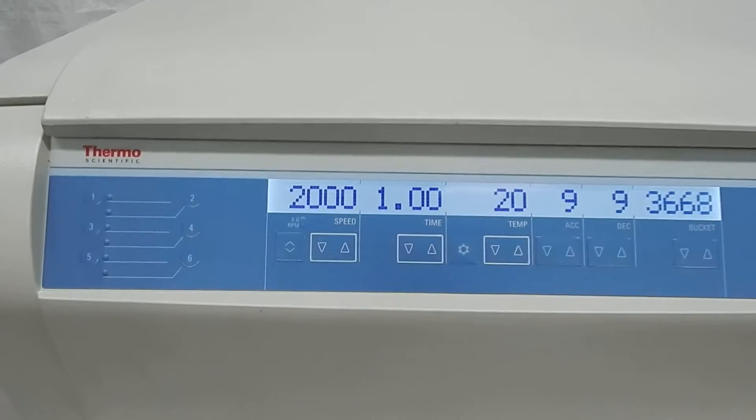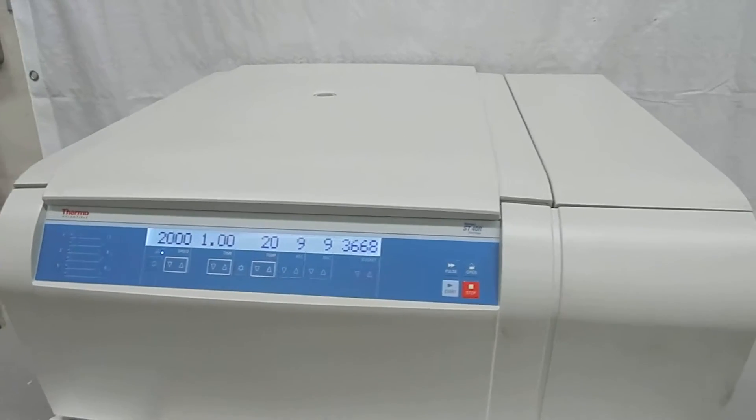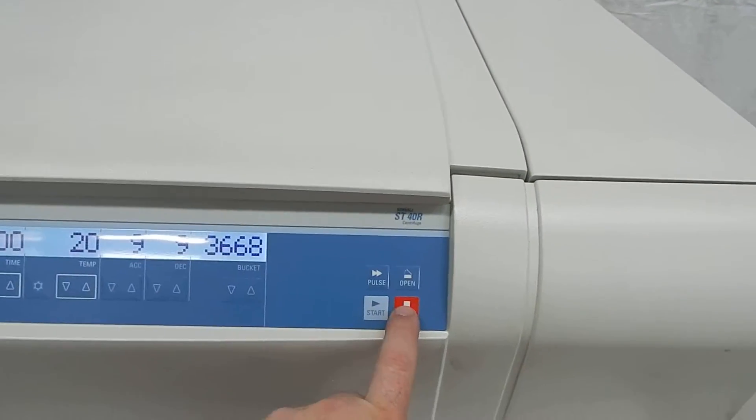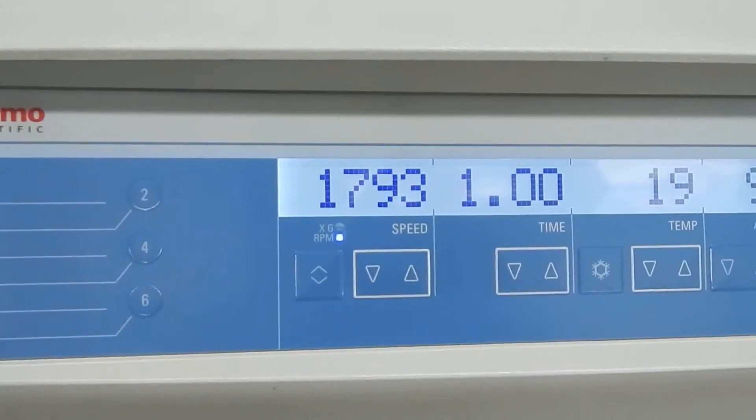It hit its target speed of 2,000 RPM. If I didn't stop the run it would continue for one hour, but I'm going to go ahead and stop the run. You can see the RPM starting to drop.